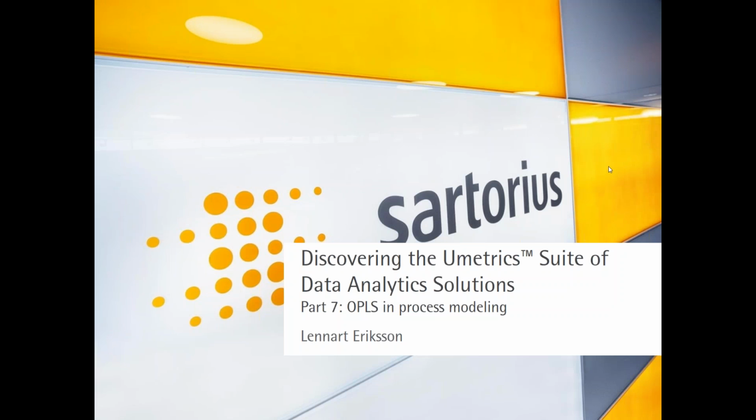Welcome to today's session on the Umetrics suite of data analytics solutions. Today's presentation has the title Part 7, OPLS in Process Modeling.